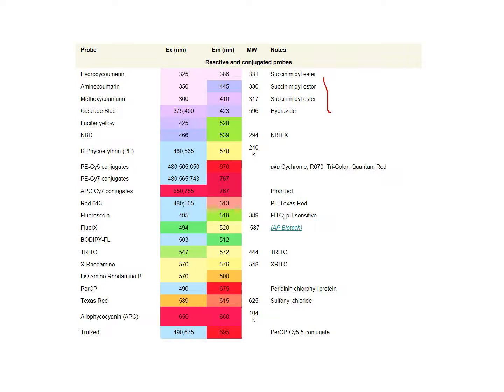So there's a lot of chemistry to this. Again, here's the, where's the, I don't know if it, yeah, there it is. So this is FITC right there. And this will be where the phycoerythrin is in this area, the red. Okay.